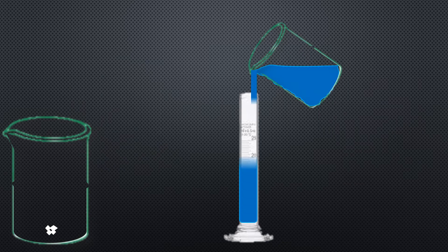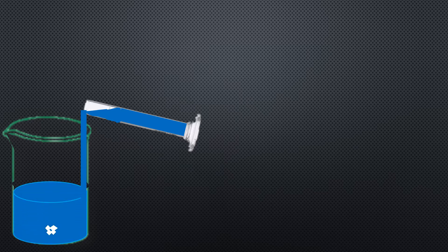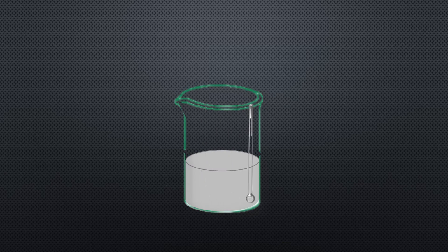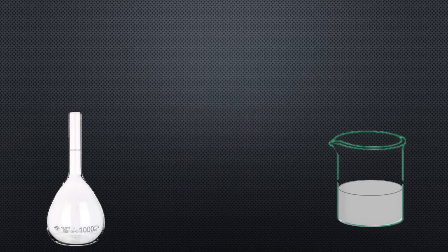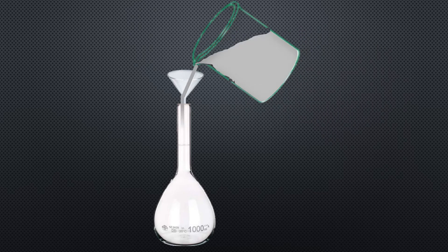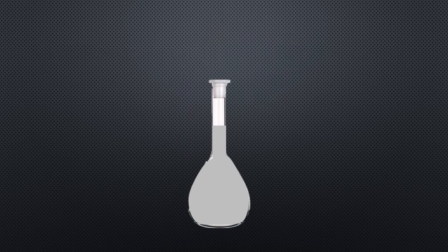Add some water into the measuring cylinder. Now add it into the beaker having 1.6987 grams of silver nitrate. Stir the solution with the help of the specula and continue stirring till all silver nitrate dissolves completely in water. Now add the silver nitrate solution into the measuring flask. Add more water if necessary to fill the solution up to the mark. Store the solution for further use. This is a 0.01 molar solution of silver nitrate.